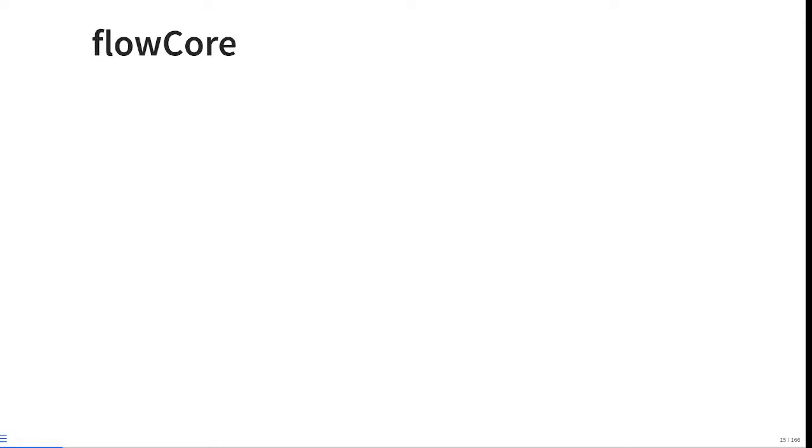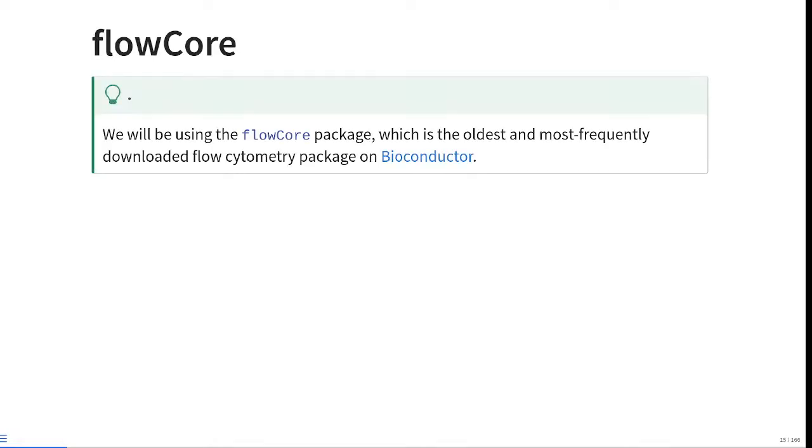So today we're going to be working with flowCore, and this is one of the oldest flow cytometry packages on the Bioconductor project. It's also the most frequently downloaded because a lot of things depend on it.